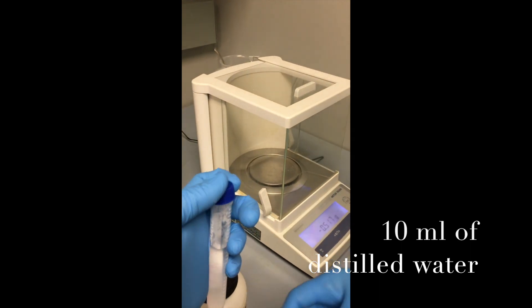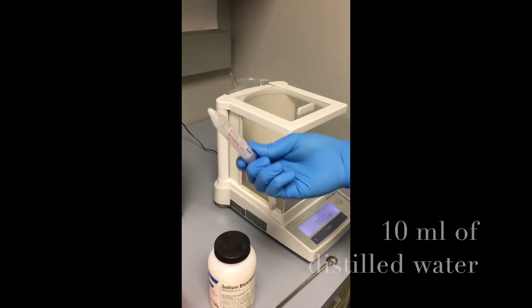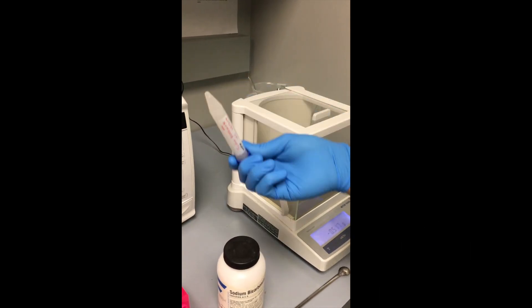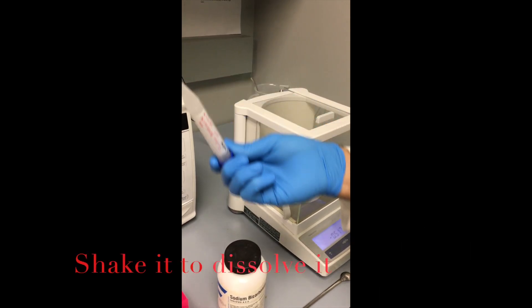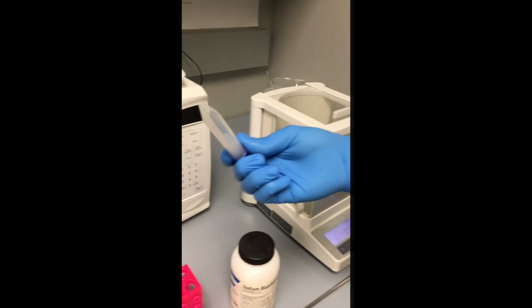Sodium bicarbonate takes a little bit of time and shaking in order to get completely dissolved. You have to make sure to invert it for about three to five minutes to get a completely dissolved solution.